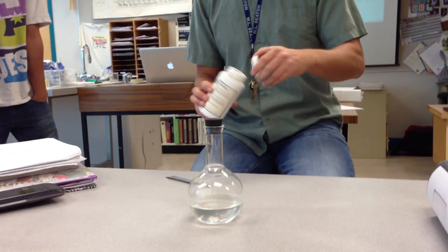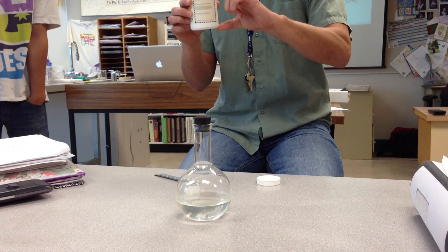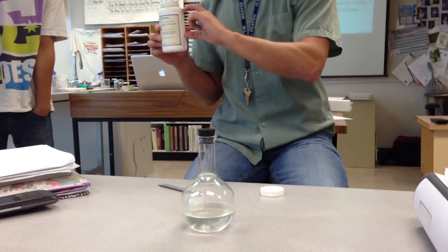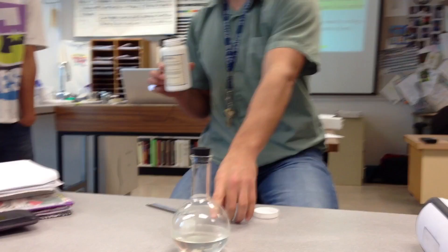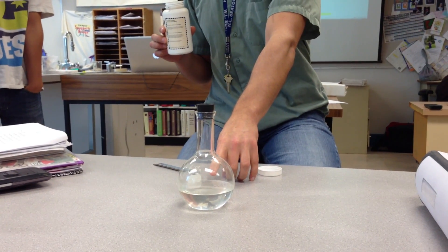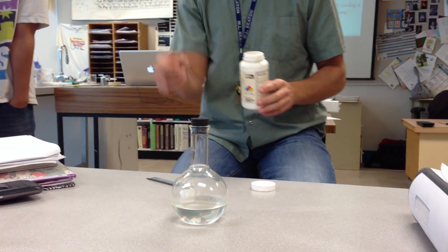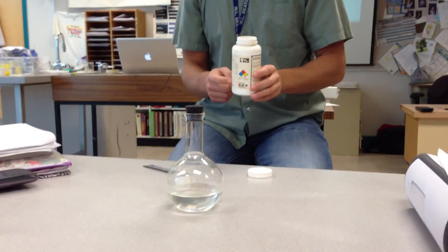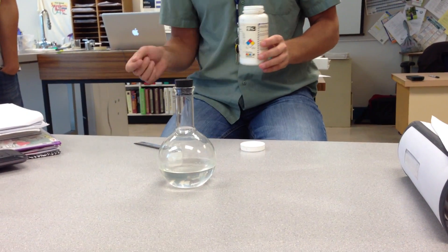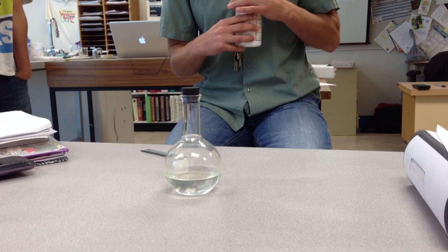You can see that the bottle is about this full right now. It was this full and then I dissolved all of this in five milliliters of water. I warmed it up and just kept dumping this stuff in, and it kept dissolving and dissolving as long as I kept it above 80 degrees Celsius.